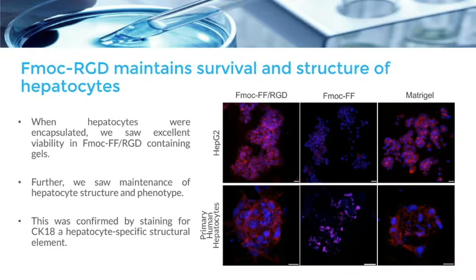If we don't incorporate that, this peptide motif noted in the middle here, we actually rapidly lose both the structure and the differentiated function of the cells. That kind of makes sense, because what this is showing us is that the cells are actually able to interact with the hydrogel, and so they're able to interact and sense what is going on around them.